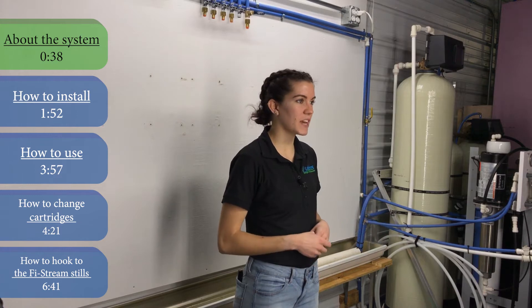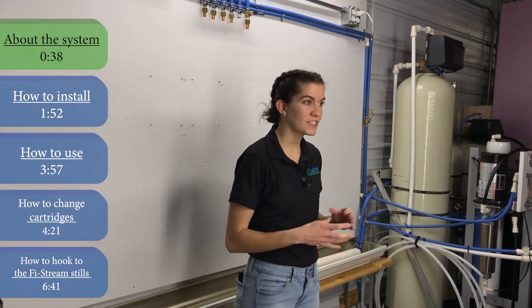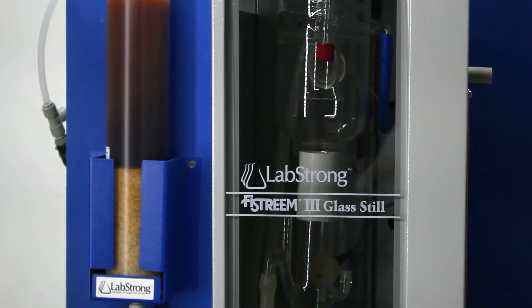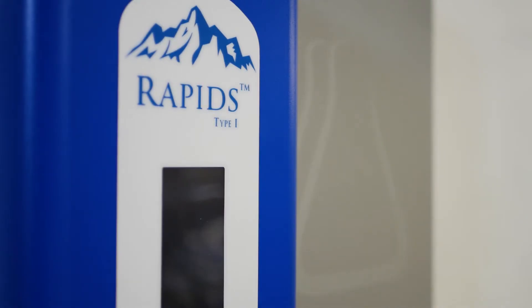This system will provide you with Type 2 water for any general lab application where you might need pure water. It's also great for producing pretreatment water for any distillation Type 2 system, like our FiStreem stills, or a Type 1 system like our LabStrong Rapids.